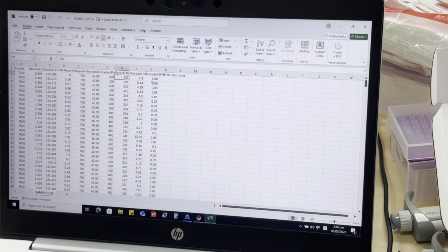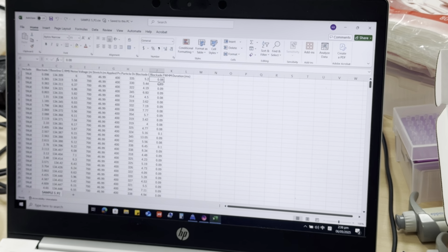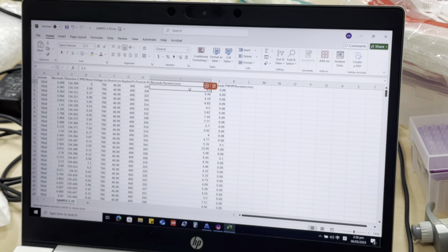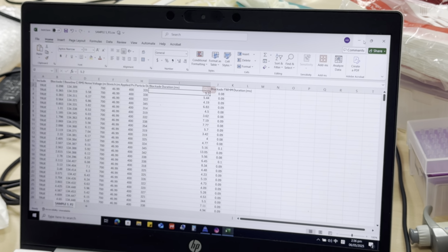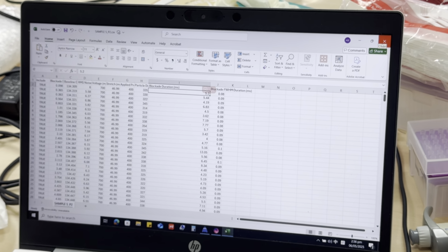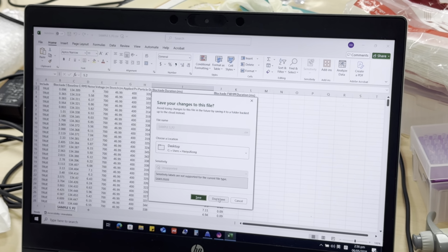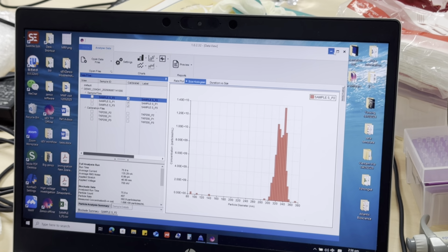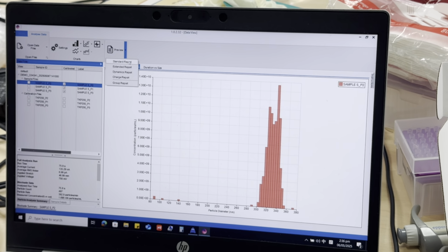This one is converted to the relative surface charge and the blockade duration. So you can see it's in relationship with the surface charge. This is the size and the concentration measurements. We can also show later how to do the zeta potential measurements, and also we can produce different reports. For example, this is a standard report.